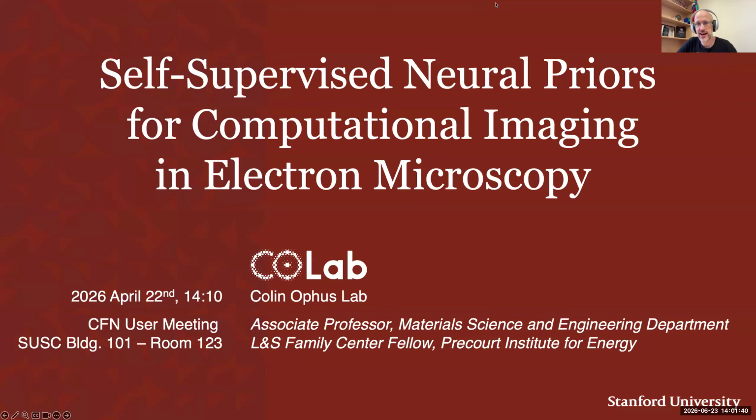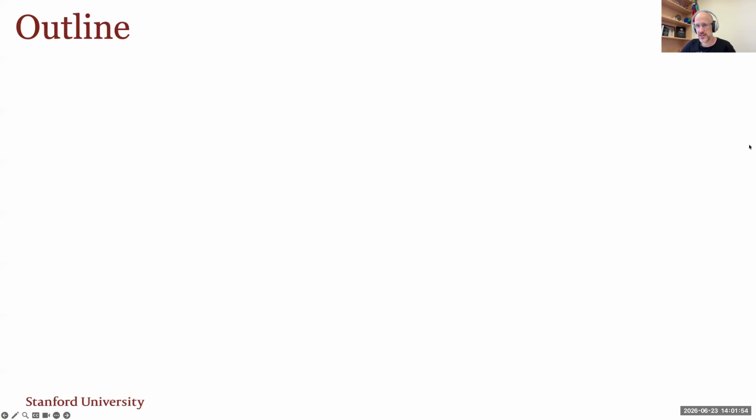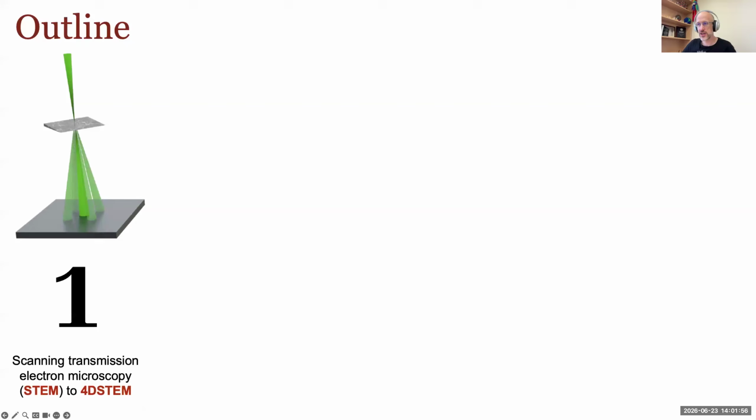So, as Garrett mentioned, I am now at Stanford University. I moved there about a year and a half ago. And so I run a group that's focused on computational analysis and design of scanning transmission electron microscopy experiments primarily. So in today's talk, what I want to cover is a brief introduction to scanning transmission electron microscopy and the four-dimensional variant, 4D STEM.